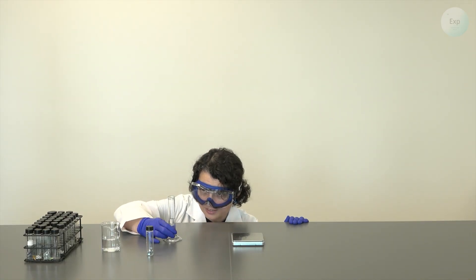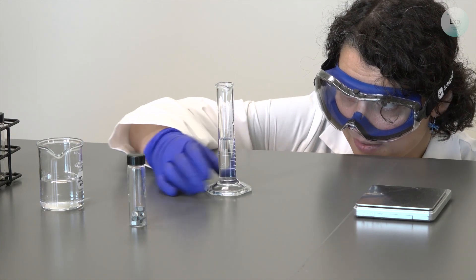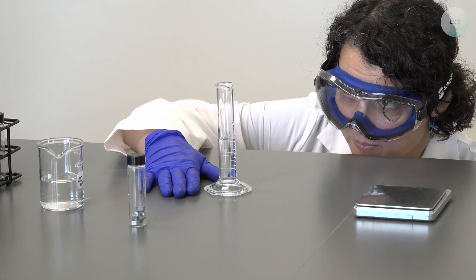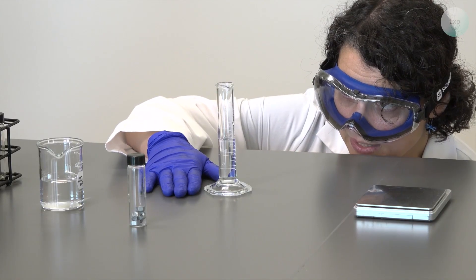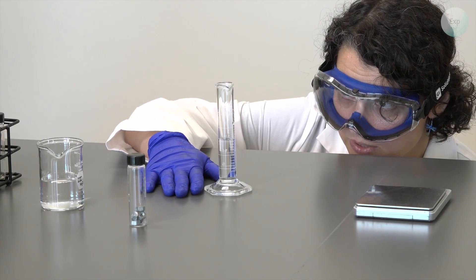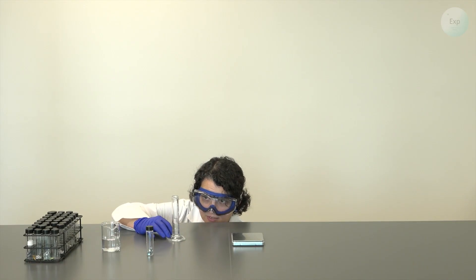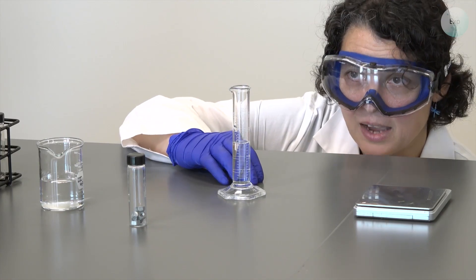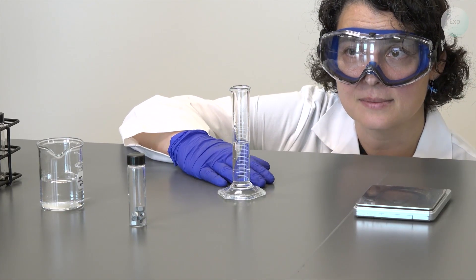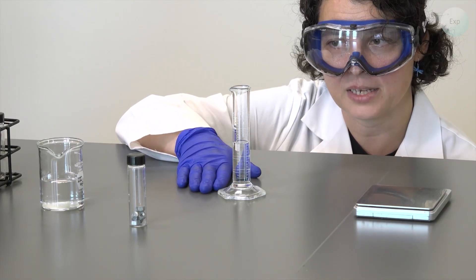And so we're going to get ourselves to eye level, find the meniscus of our water and then record its volume. My volume is between 15 and 16 milliliters. That means I am going to use a number to estimate which value it's closer to, which in this case it is closer to 16. I will estimate that number to be 8. So 15.8 milliliters of water by itself.